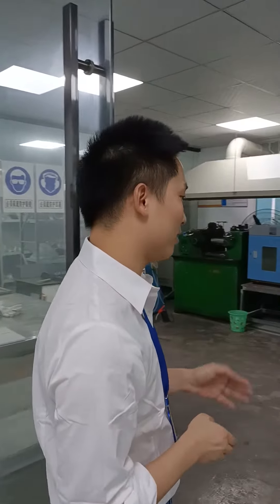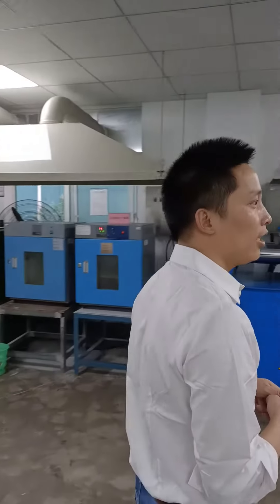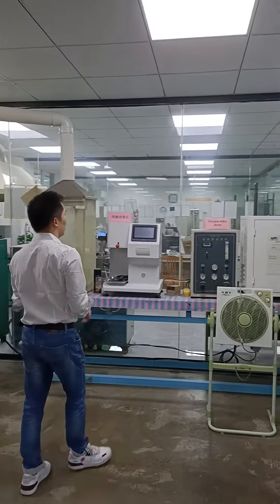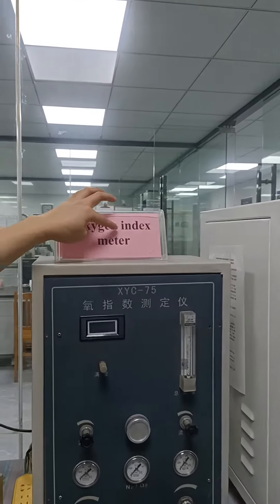Hello everyone, this is our third room for the laboratory and I will show you some testing machines, a lot of testing machines. Here, this machine is for the oxygen index meter.